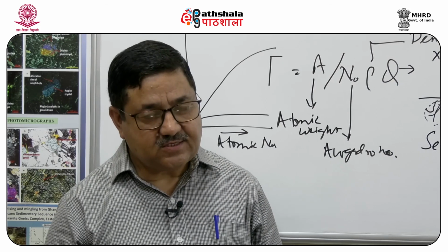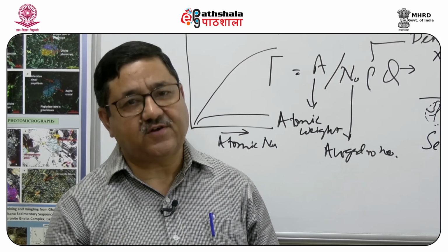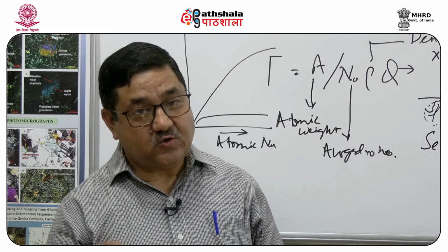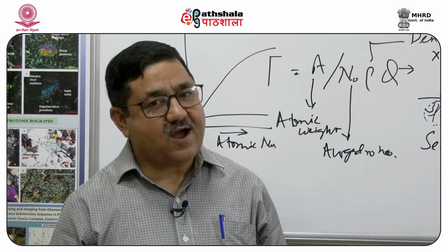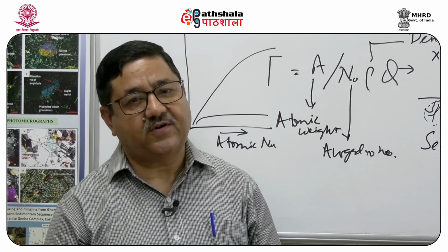It allows us to distinguish detailed morphological features of fossils and other material. It also allows us to distinguish the zoning which is observed through visible light and other effects, and it allows us to interpret the magmatic and metamorphic history of a rock.